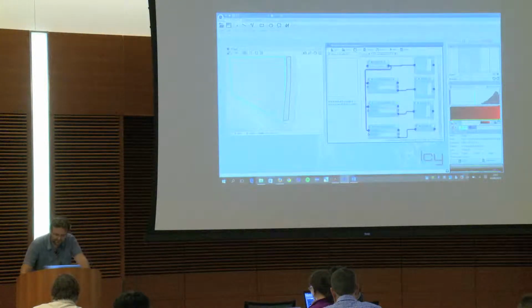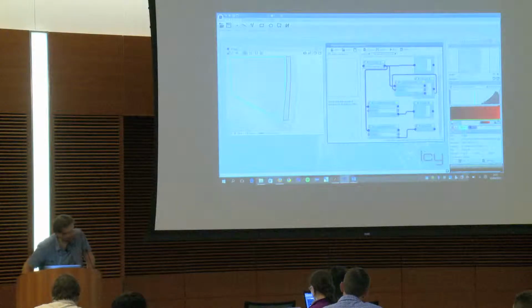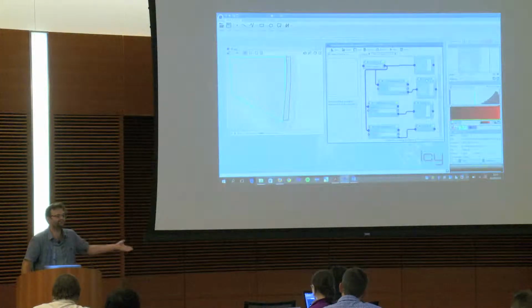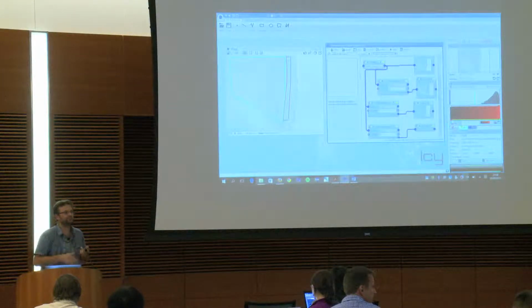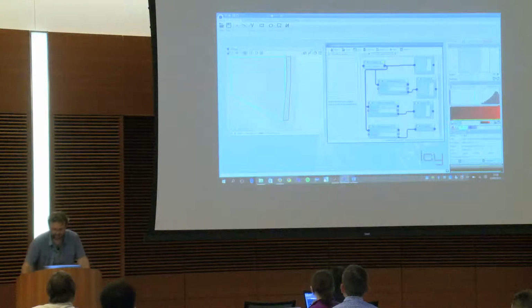Because to build this, you just take this input and then you wire it to the next box, like this thing that is going to extract the channel. I'm just checking if you see it. And then you can attach it to a display. So some of those boxes are smart because they can adapt to the input. And some of those boxes have parameters that are constrained. So you need a number to enter here, you need an image, you need something with 5 dimensions, you need a ROI. Okay. So it's very, very easy.